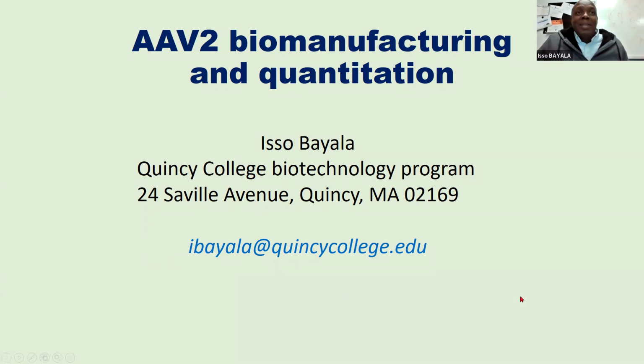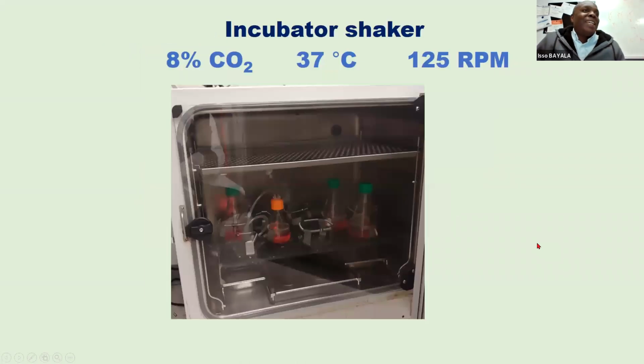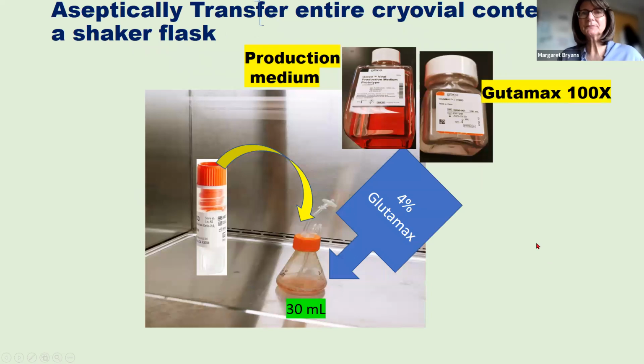Thank you, Maggie. Hi, everybody. So this is the continuation of the first part. I'm going to do a quick summary of what we did in the first part, then we're going to move to the quantitation of the virus particles.